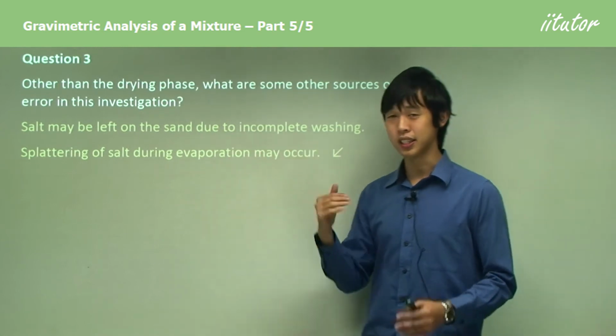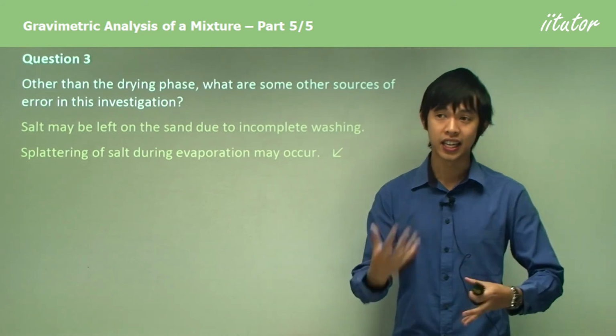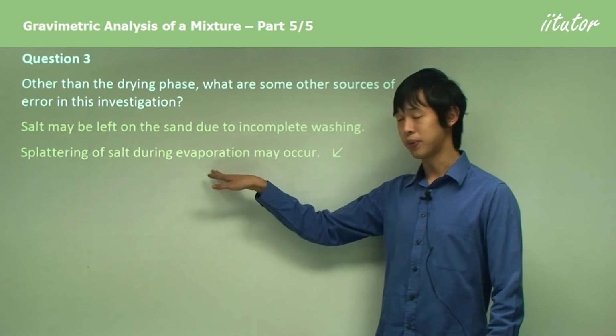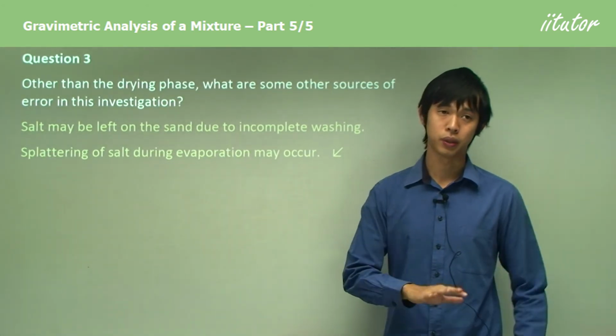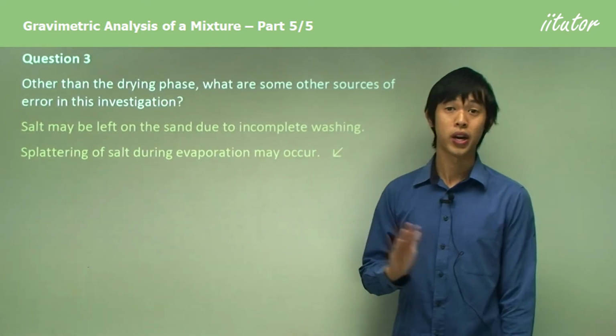But this one is a little bit harder because it's not always immediately apparent how clean the sand needs to be. So that's just something to think about. This one we can basically get rid of. This one is a little bit more difficult to completely ignore. Okay, so just two sources of error that have different ways of dealing with them.